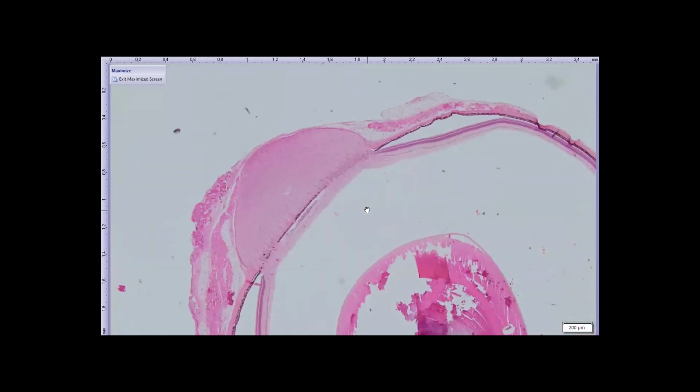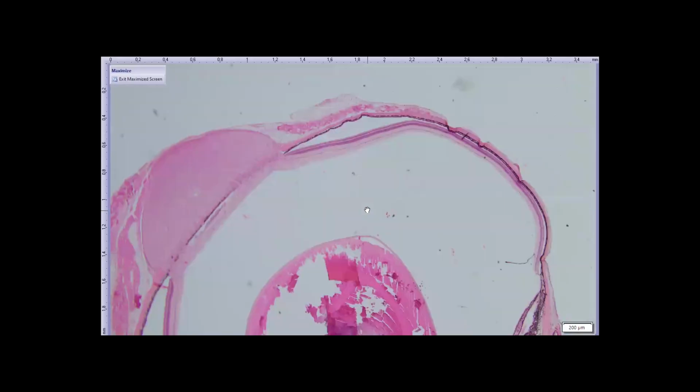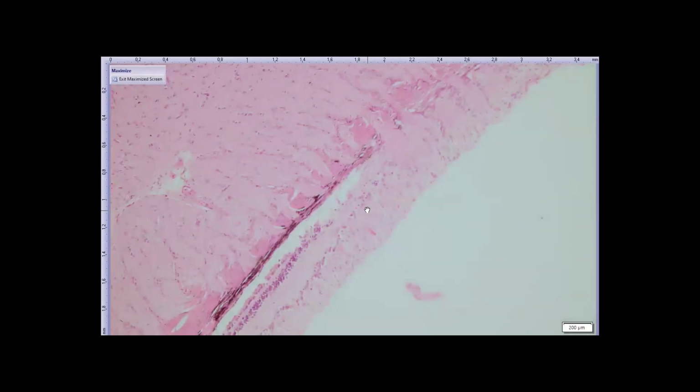Okay, now I'm going to show you another rodent with a similar lifestyle. But this eye is cut in the horizontal plane. And there's the optic nerve head cut in the horizontal plane. And if you look carefully, you can appreciate that in this plane, it's a series of little fenestrated structures, each one of which is more or less the same as the junction of that 13-lined ground squirrel. So this is a chipmunk, also a ground squirrel with similar life habits.